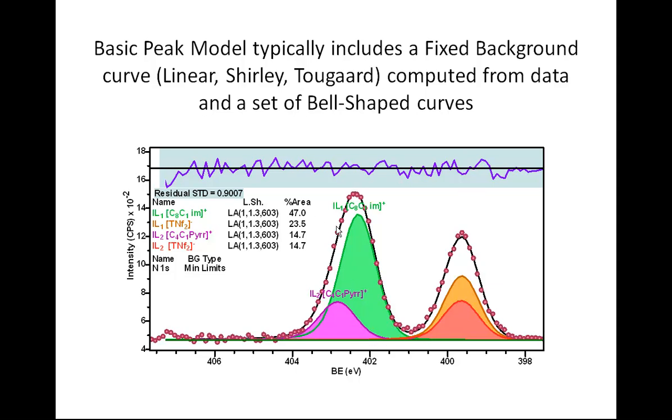But there are other cases where the background can be calculated from the data and it represents some type of response.